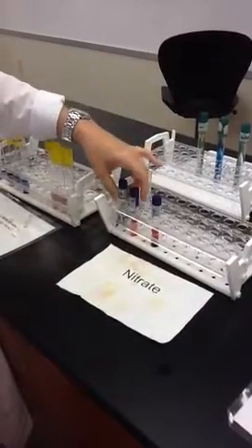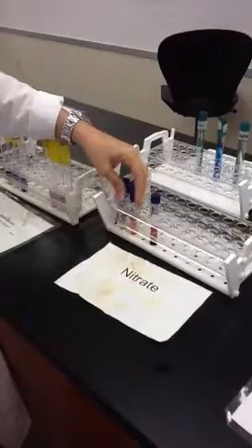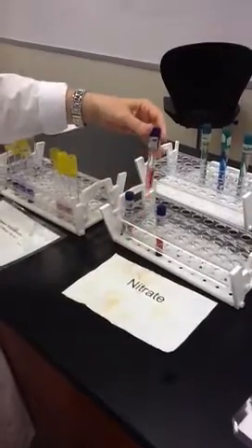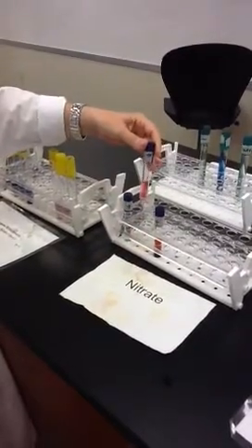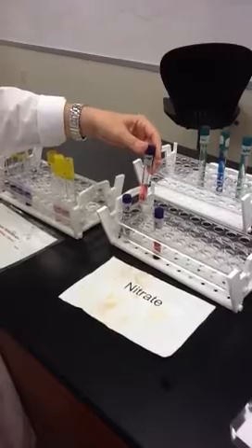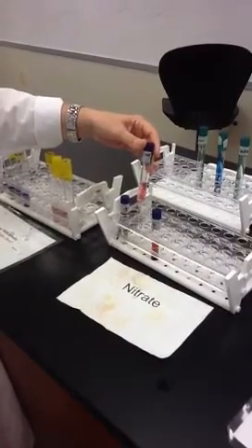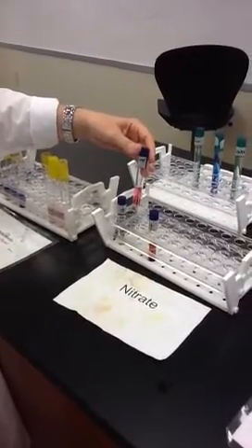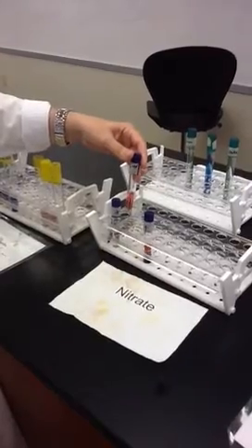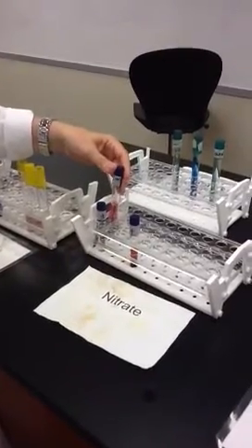There were two tests for the nitrate, remember? The first reagent we added was... What was the first reagent we added for nitrate? I don't remember. B? Yeah, it was reagent A and B.